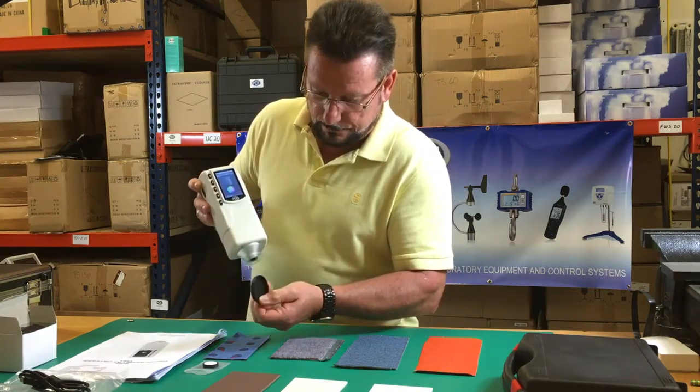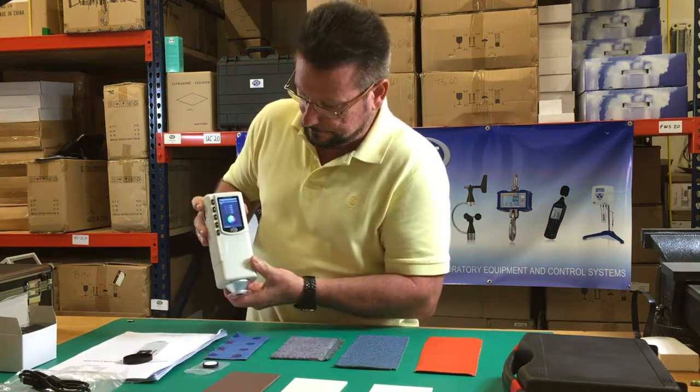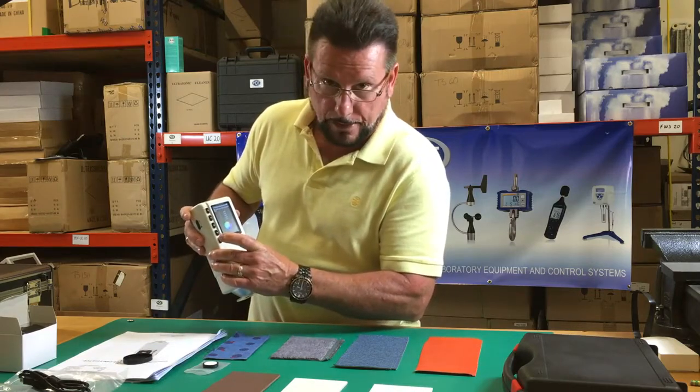Take off the protective cover. And now we're ready for calibration.